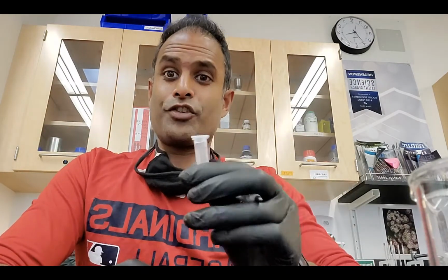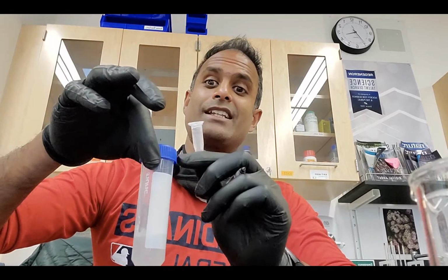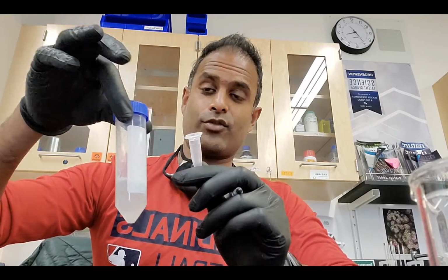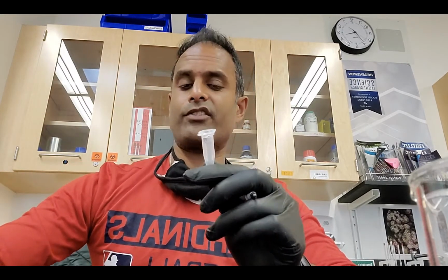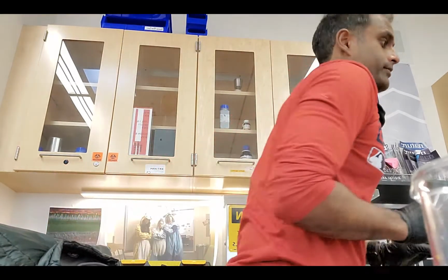Just as a warning, you want to make sure that you label the thing that is attached to the tube. So, for example, if I was using this Falcon tube, I would not label the cap. I would label the side of the tube. Obvious reasons. All right, great. So I'm going to go off and centrifuge this down, and then we're going to take a look at what comes out.